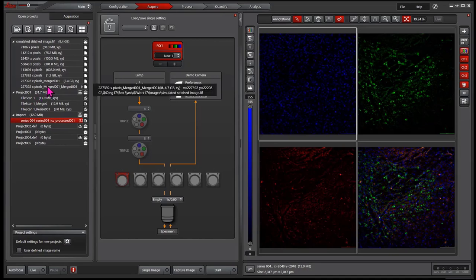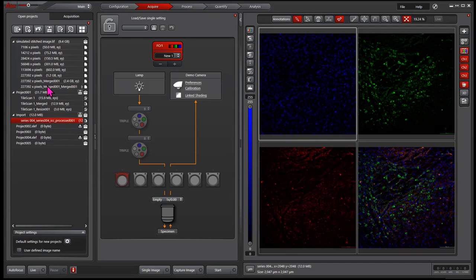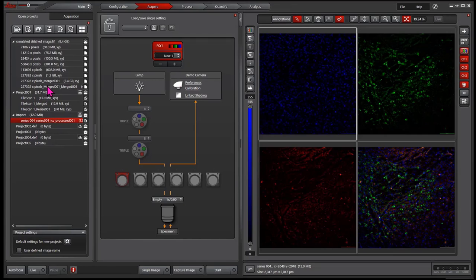However, if you do a big stitching in Navigator, it's just one single experiment that will produce a big file. You just have no other choices. So this time, we will have to get a bigger LIF file. This file sometimes can be hundreds of gigabytes big. Two things happen next usually.